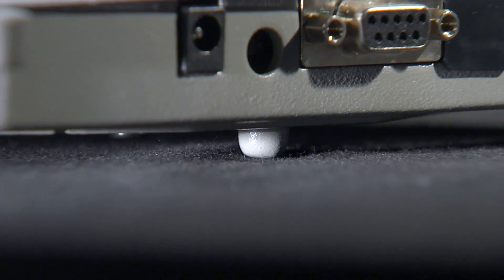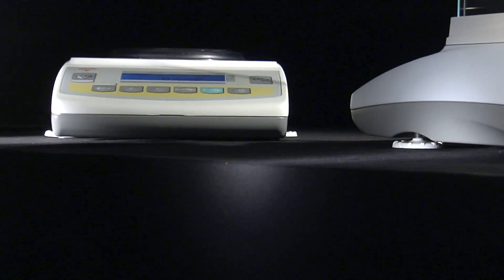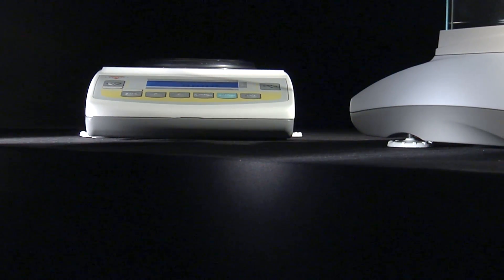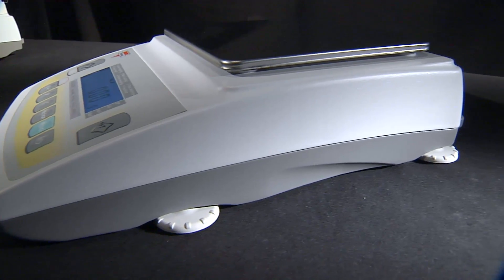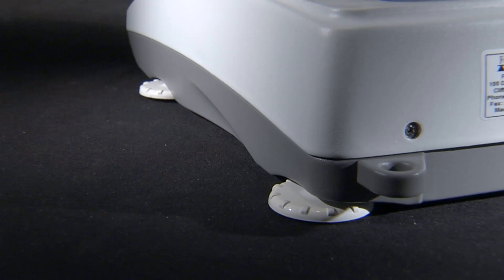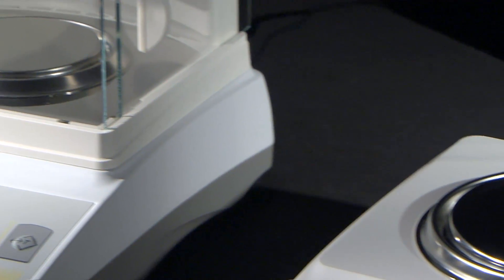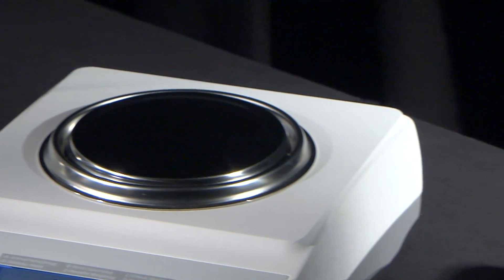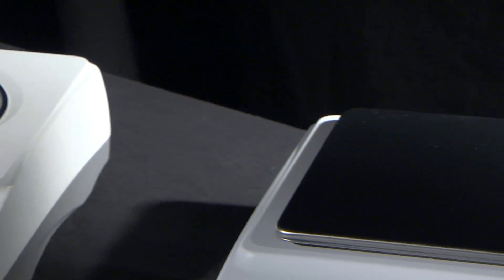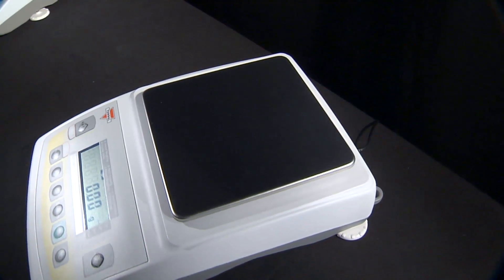The base uses a tripod support system with one fixed leg and two adjustable legs conveniently located in the front of the balance. High capacity models feature four adjustable legs for added stability while weighing heavier loads. Every AGC scale or analytical balance is furnished with a stainless steel pan that is resistant to chemicals and possible staining.